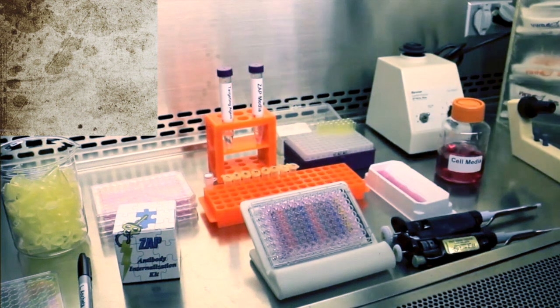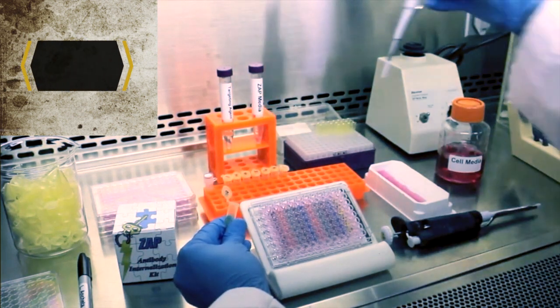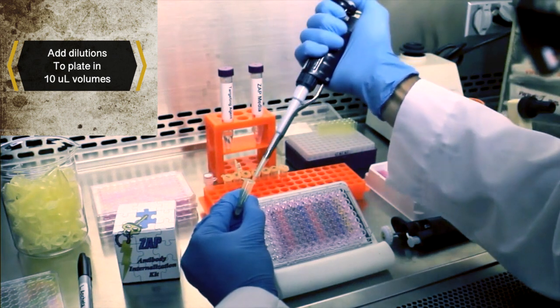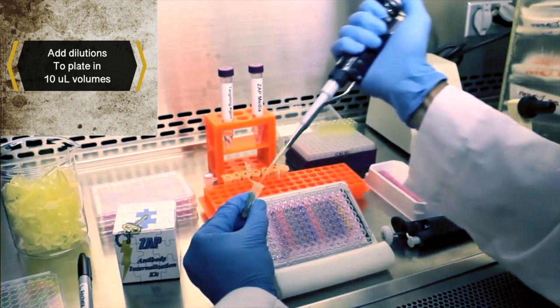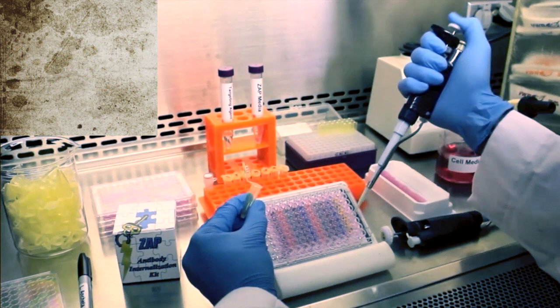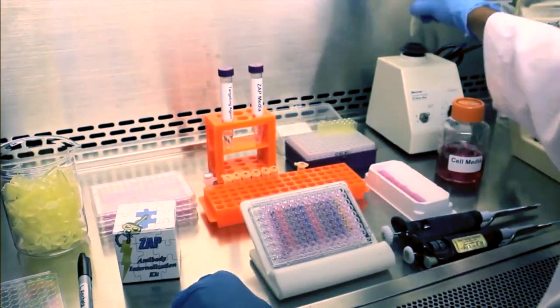Starting with tube number 8, vortex briefly, and add 10 microliters to each of the 6 wells of the column marked for tube number 8. Repeat this step for all the tubes.